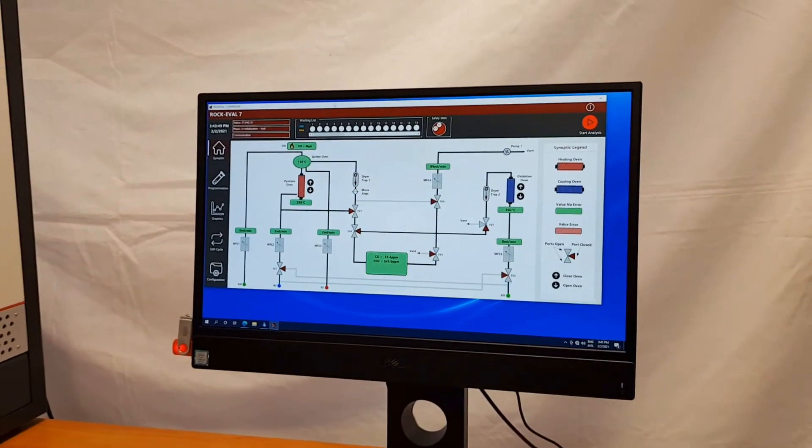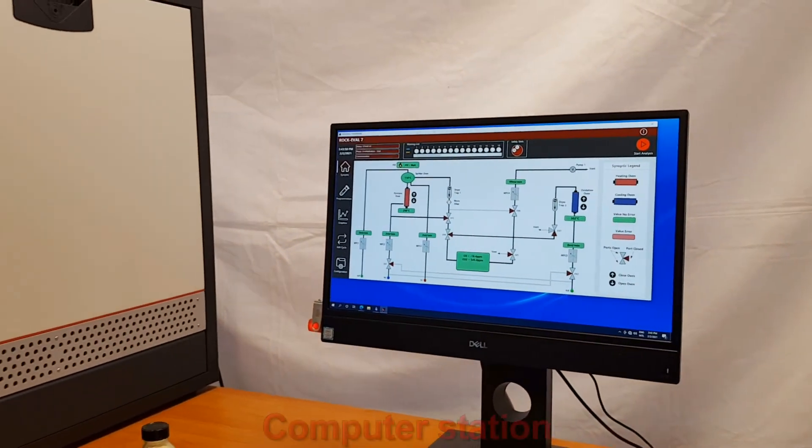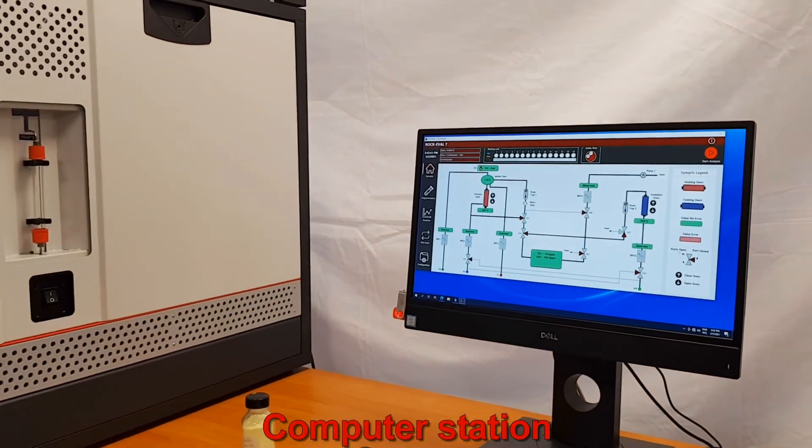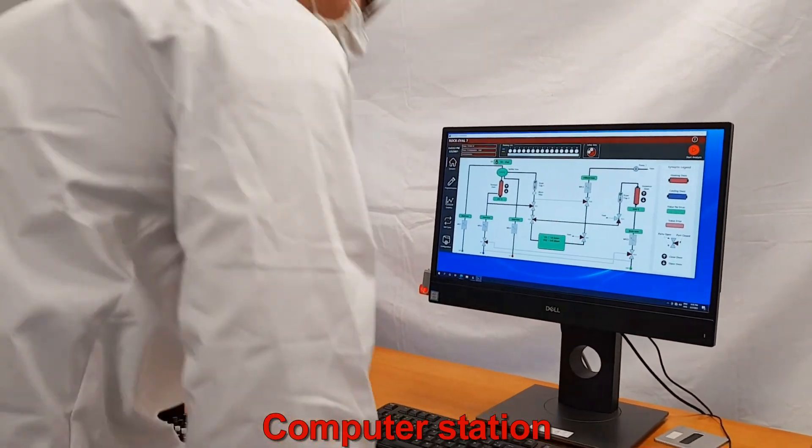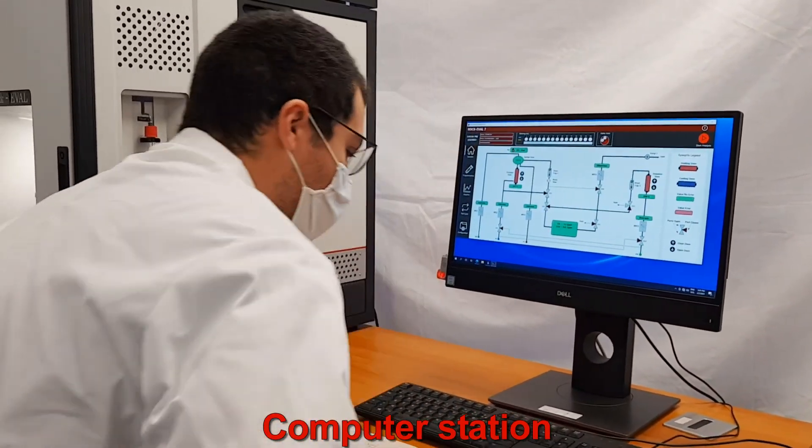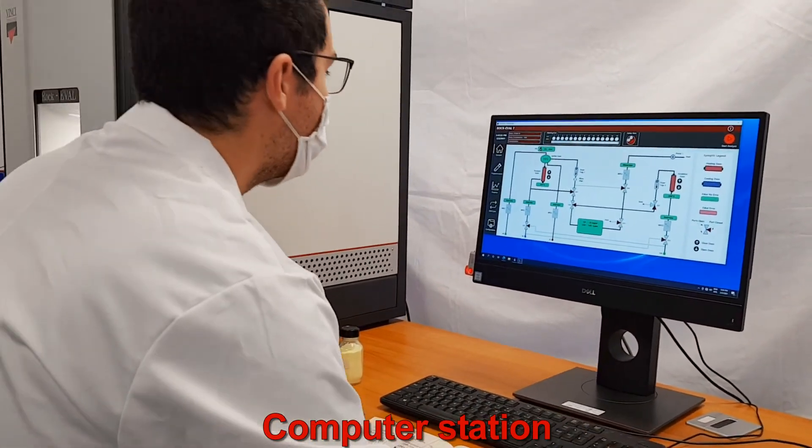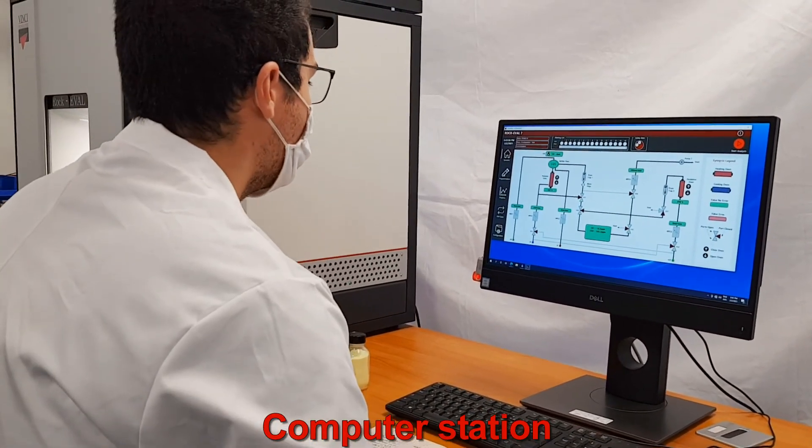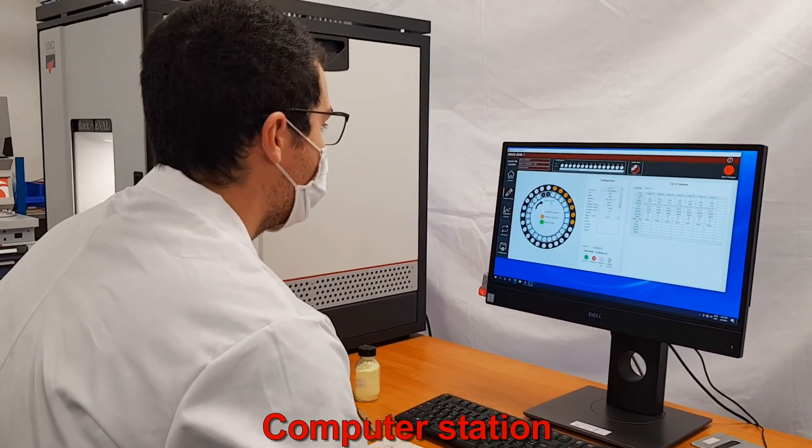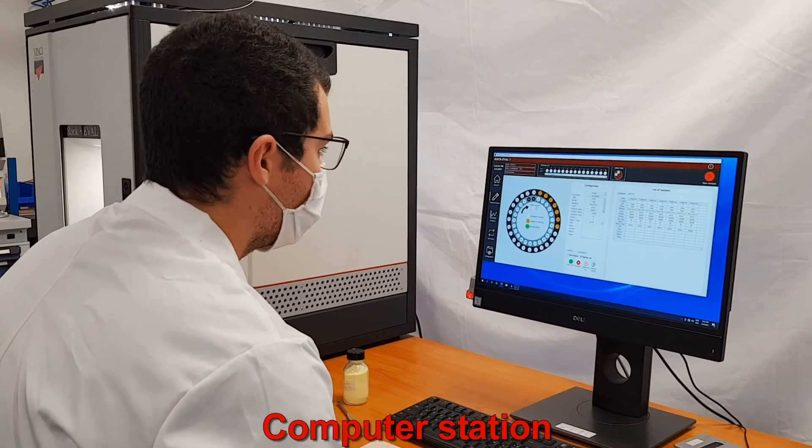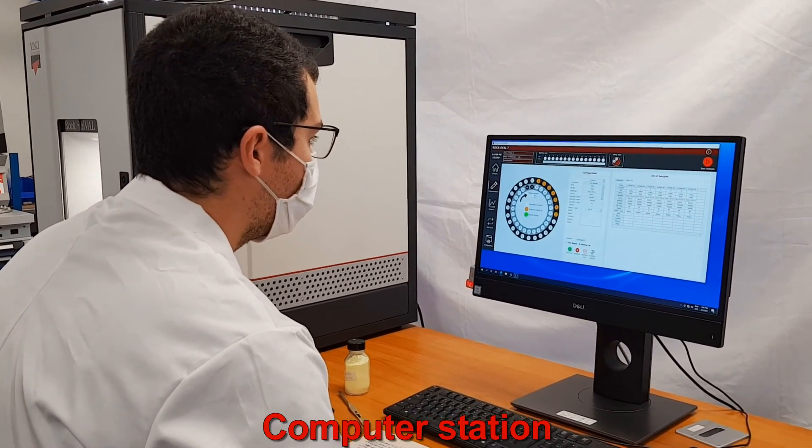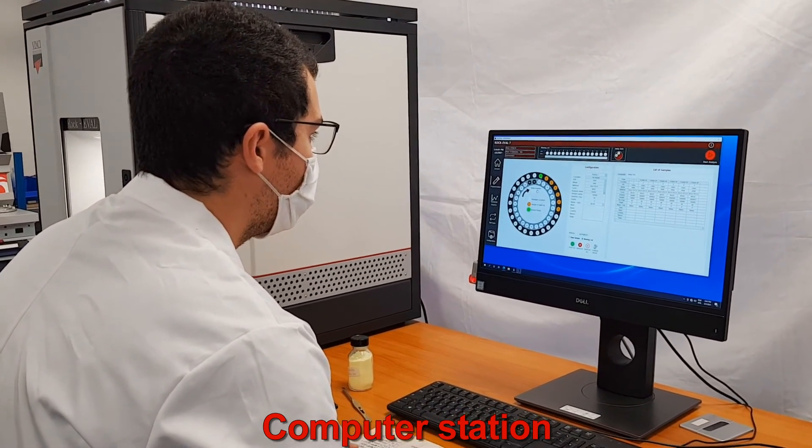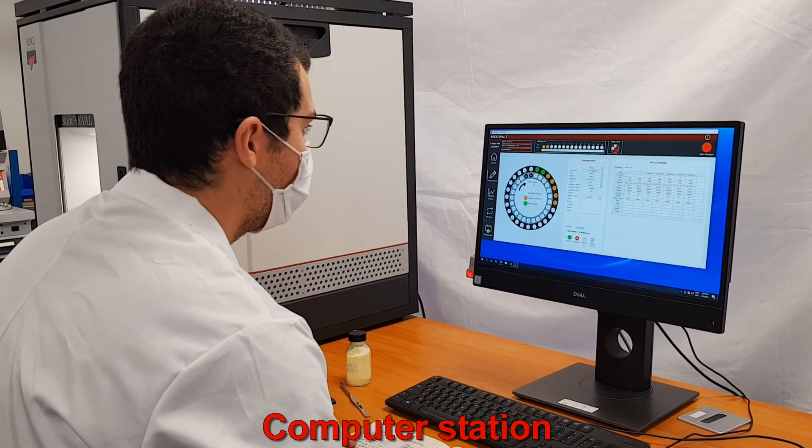A computer station allows display of the instrument flow diagram, real-time curve acquisition, and error messages and warnings. A dedicated menu permits easy entry of test parameters.